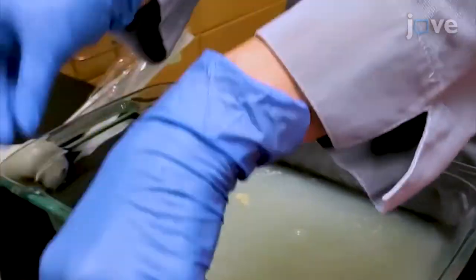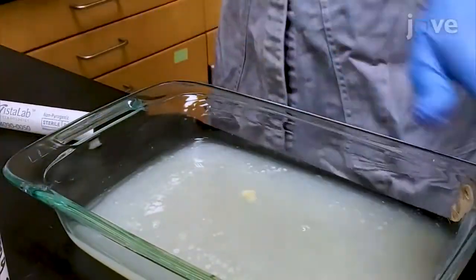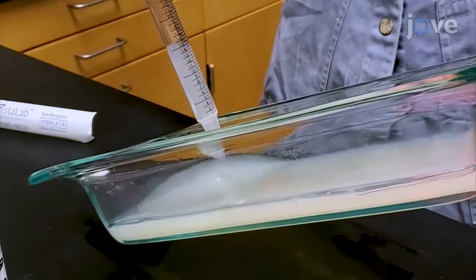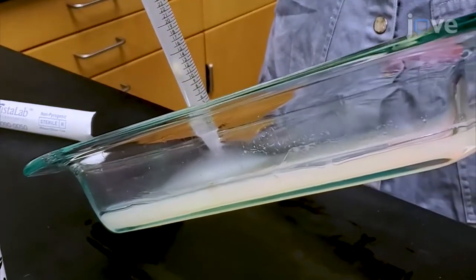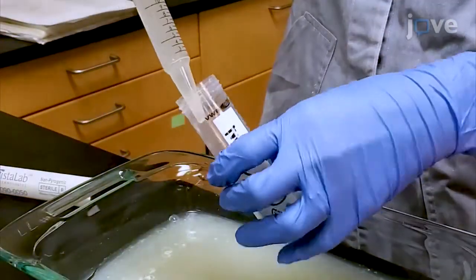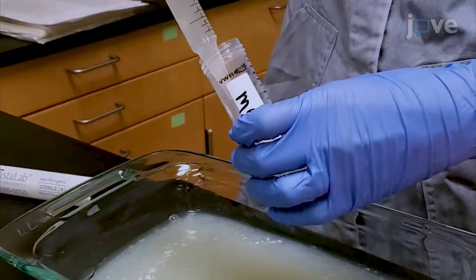Prime a sterile serological pipette with M9. Tilt the plate so that the M9 and worm population gather into one corner of the plate. Use the primed pipette to aspirate the worm suspension and add the worms to a 50 milliliter conical tube. Place the tube on a rocker.